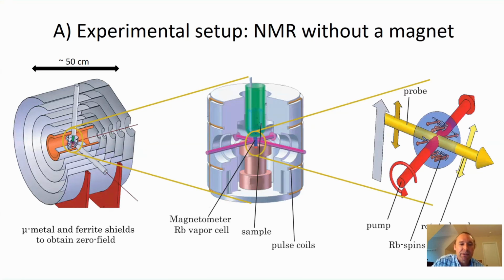And by 0, I mean that you cannot really distinguish anymore between protons, carbons, nitrogens with different gyromagnetic ratios, and they all have the same frequency of less than maybe 0.1 hertz of proton frequency or below.